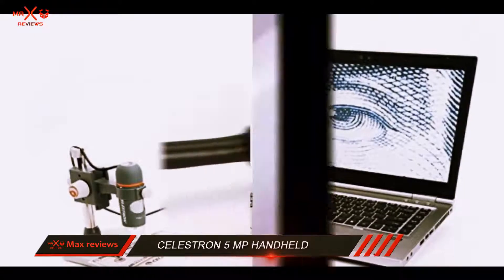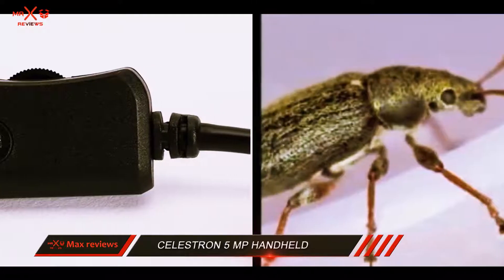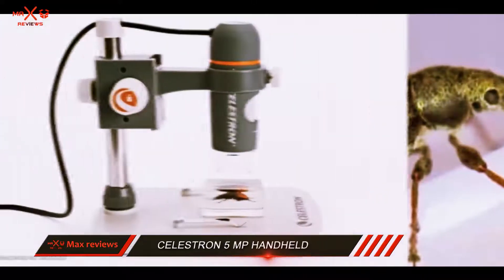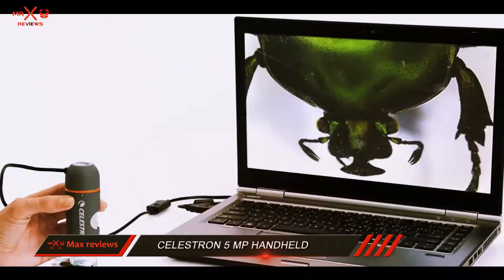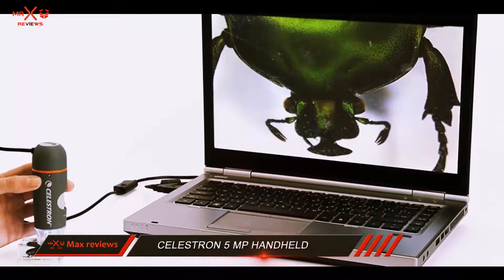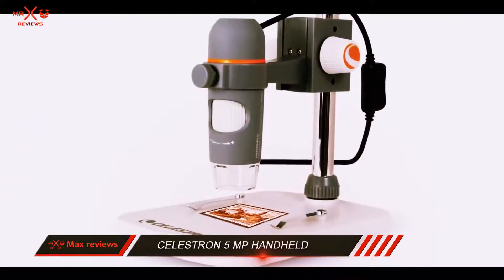With a magnification ability of 10 to 200 times, you would see a lot of details of the object with the help of this microscope. The Celestron Digital Microscope comes with software in the box, so there is no need to visit any website to download anything. This software is compatible with Windows and Mac, and once you've installed it on your computer, be ready to enjoy a hassle-free experience.